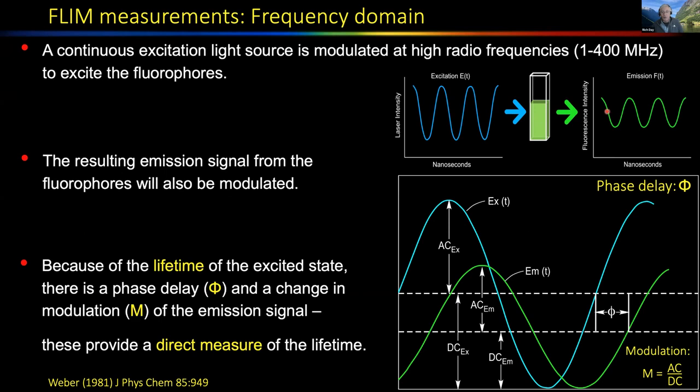And again, as you all know, because of the lifetime of the excited state, there's going to be a slight phase delay in that emission waveform. And there's also going to be demodulation of that emission waveform. And we can measure these both precisely and obtain a direct measurement of the lifetime.